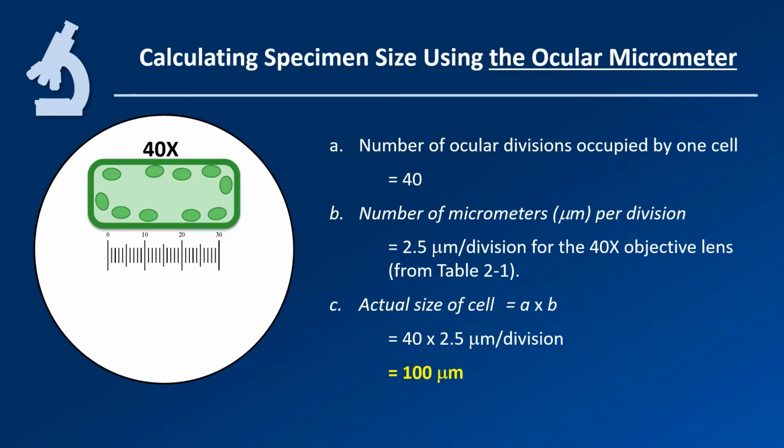So I'm getting the same number, and it's the same number I found when I was using the proportion of field method as well. This is always good, like I said, when your numbers do match up, and so I'm pretty happy with that.